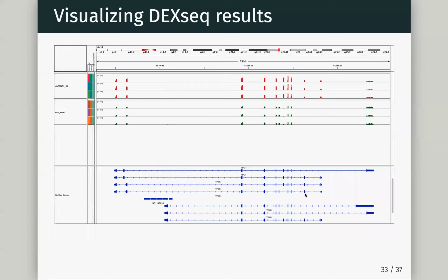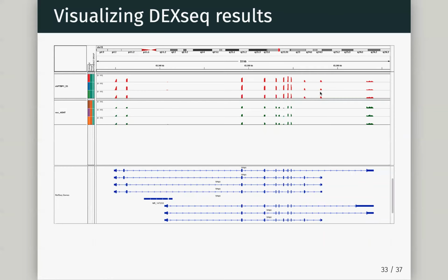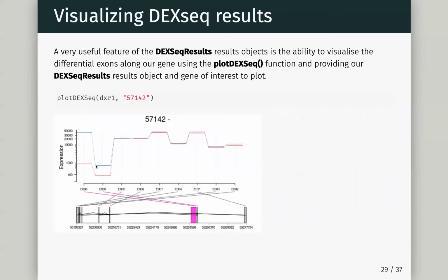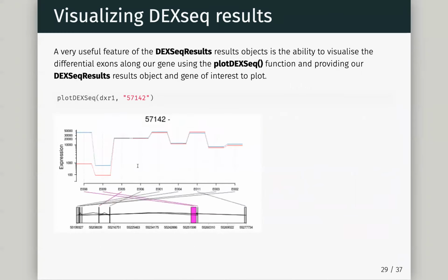If you go into IGV, we can start to see what's really happening. And it's these exons here, which I guess would have been, I think this is backwards. It's going the other way. Would have been these ones here. But we can also go back into the actual table and see which exons it is, and then go and review those in IGV.